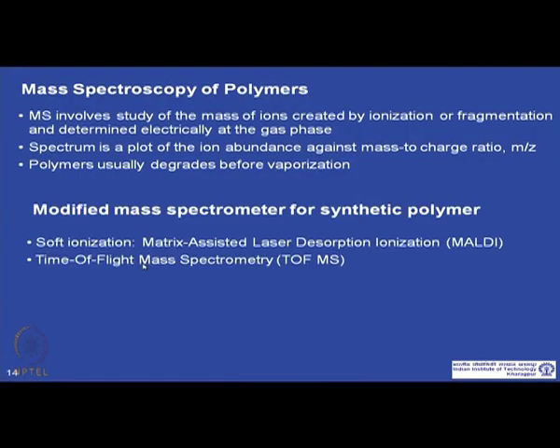So, we must have some mechanism by which polymers can be vaporized without any degradation or fragmentation of the polymer chain. So, what is the modification done to get the mass spectra of polymers?